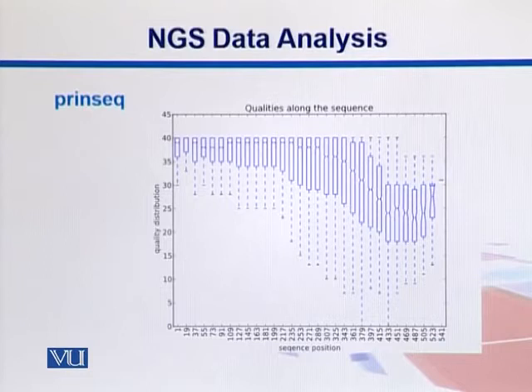where we are putting these quality scores. This representation is called a box and whisker plot. We will cover it in some statistics primer later on, but just get a general idea. So these boxes represent where we have those middle 50% of the values, and then obviously we have a lower 25%. Let me draw it somewhere here.